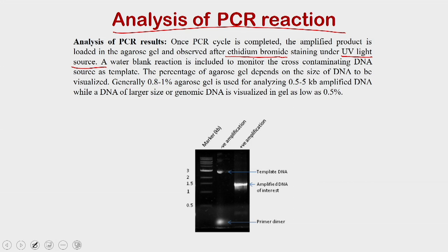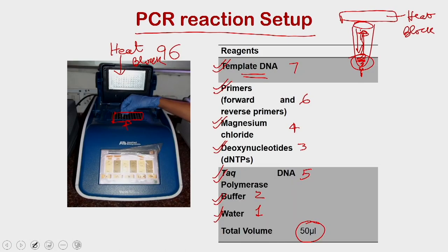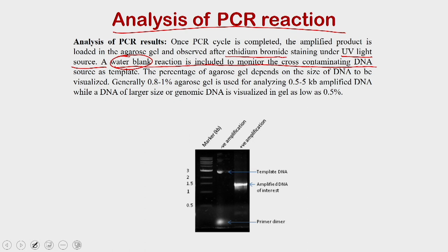Many times when you are doing PCR for the first time, you always run a water blank, which means when you are setting up the reactions, instead of adding the template, you are adding water, so that you will know that there is no cross contamination in your reactions.